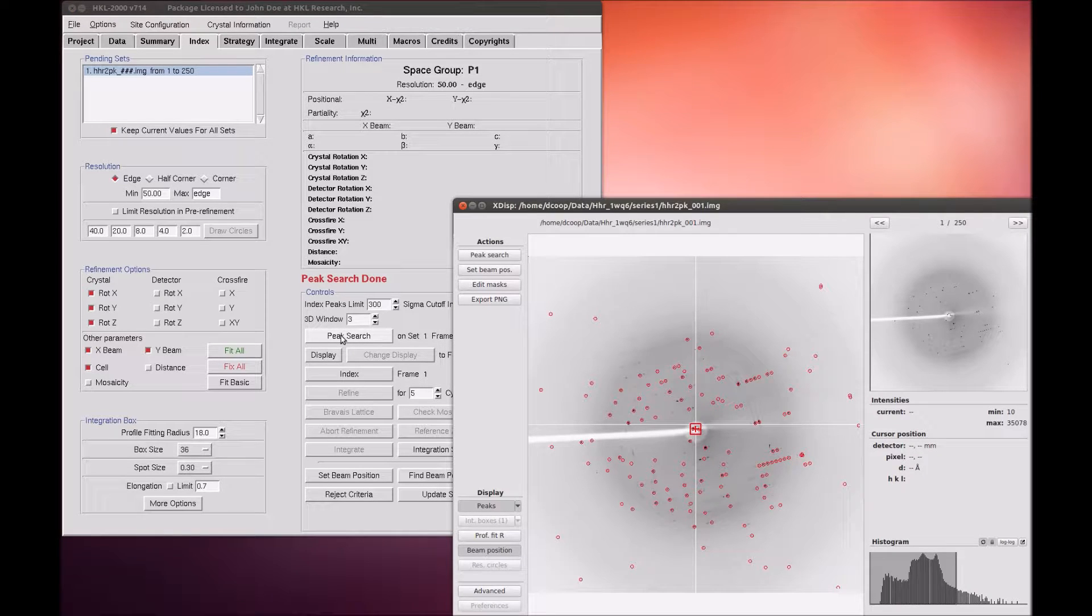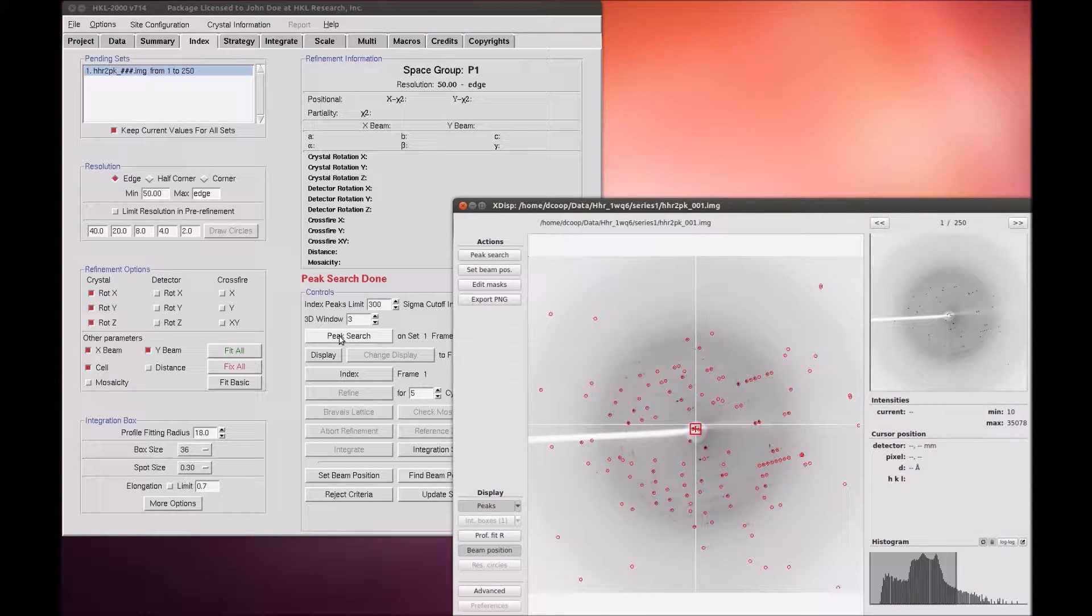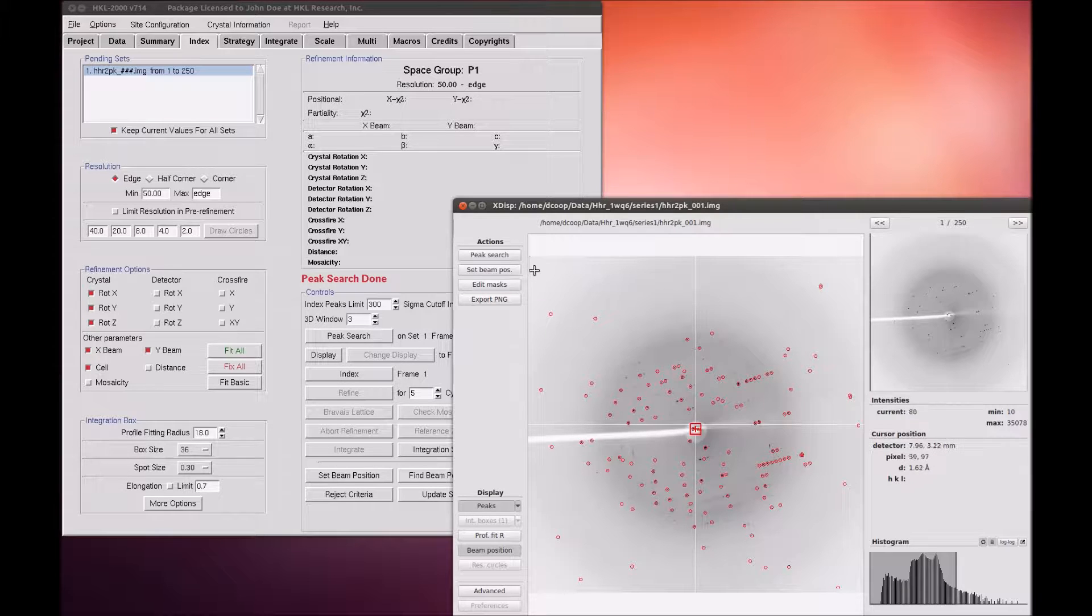If you use the Peak Search button, XDISP will open and peaks will be picked with the default settings, which are often sufficient.